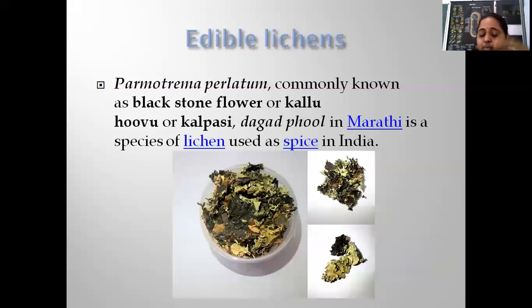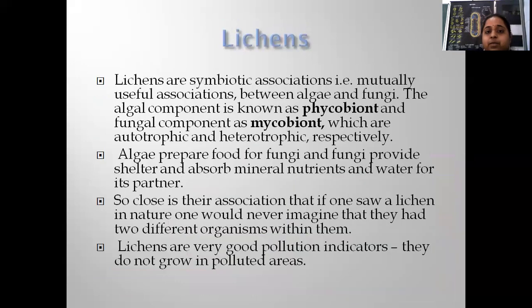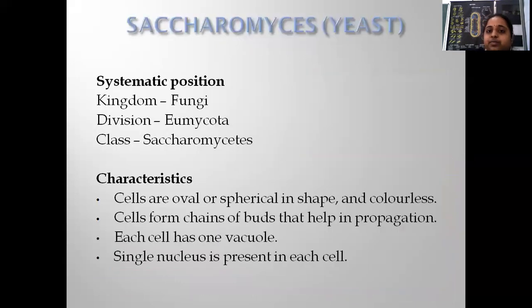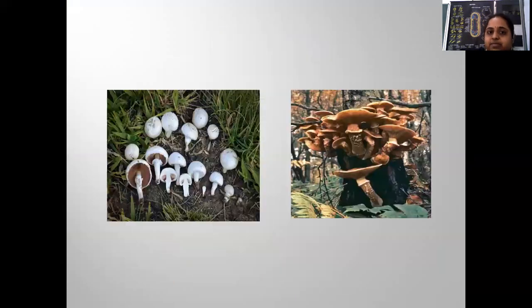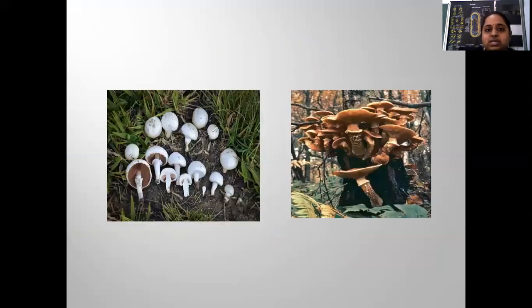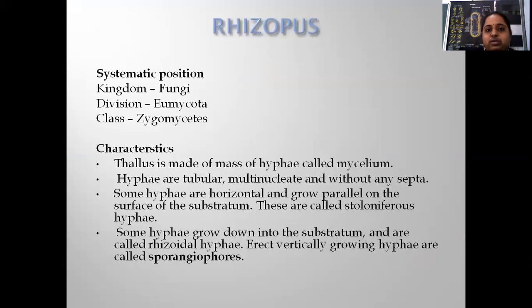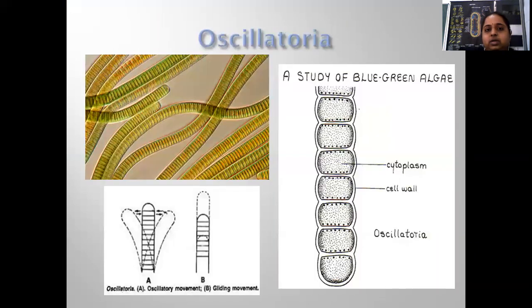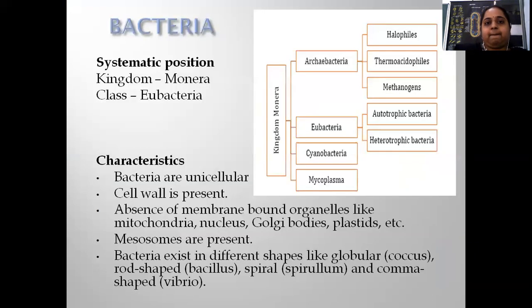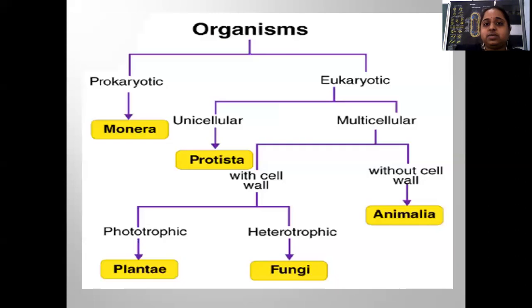So today we have covered lichens, yeast, and mushroom, Agaricus. With this, the practical, that is the study of morphology, will end. I'll just revise once again whatever we have studied. We started with what morphology is, the study of external features.